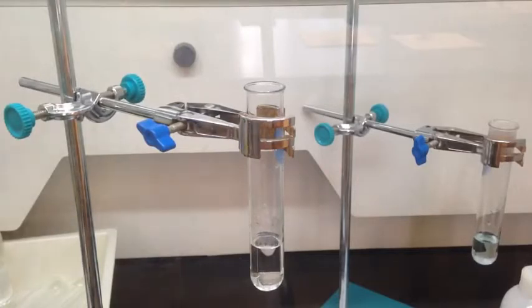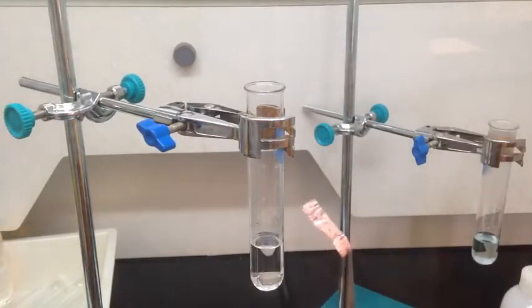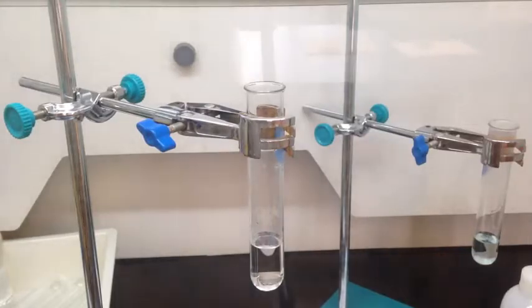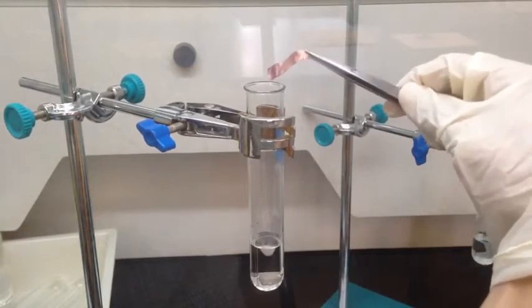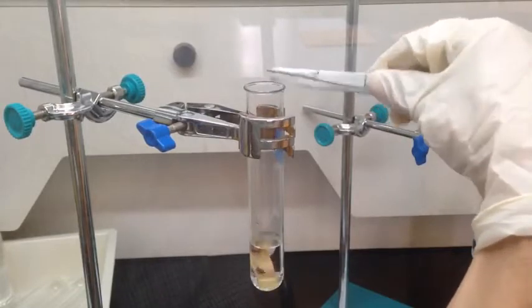And then this time we have copper metal. Copper metal, as we have learned in the topic of acid and alkali, cannot react with acids. Most of the acids cannot react with copper, except nitric acid. This time we have a concentrated nitric acid and see what would happen. I have a tube of nitric acid, and I put a piece of copper into it now and see what would happen.